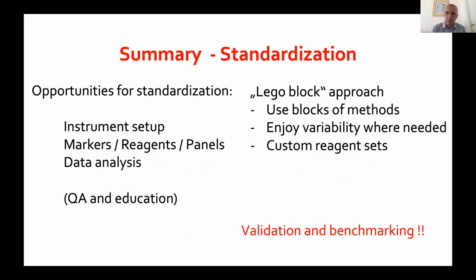And I even hope that what will be coming more in the next years is a possibility to produce custom reagent sets on demand, so that there will be better stability in terms of dried cocktails, and still a relative freedom in the decision of what needs to be in that particular cocktail.